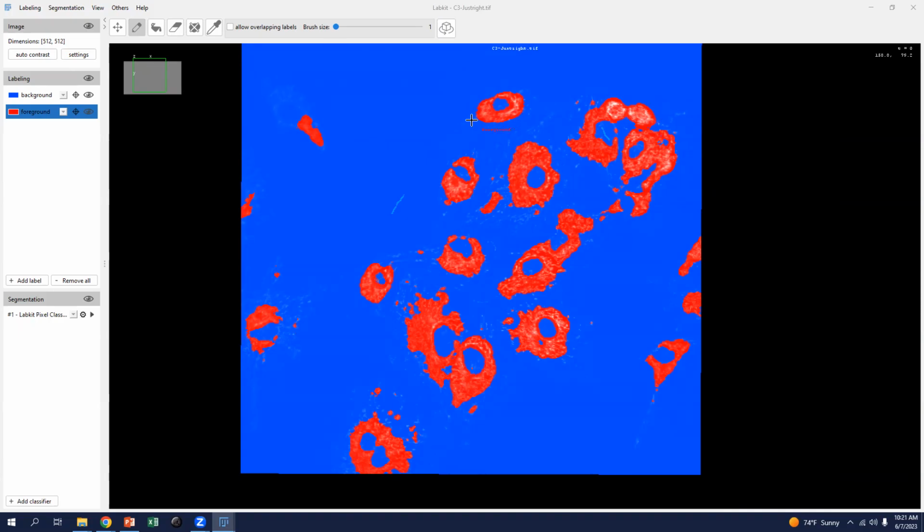And at a later point, you can, in fact, save the model you've trained and call it back up in order to automatically process lots of data. So you can do that subsequent processing on a more powerful computer or one of our workstations. We offer workstations designed for this kind of high capacity computing.